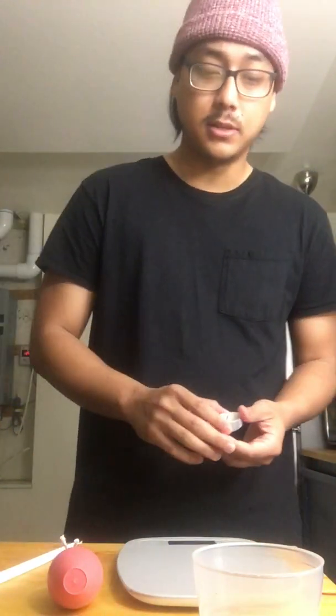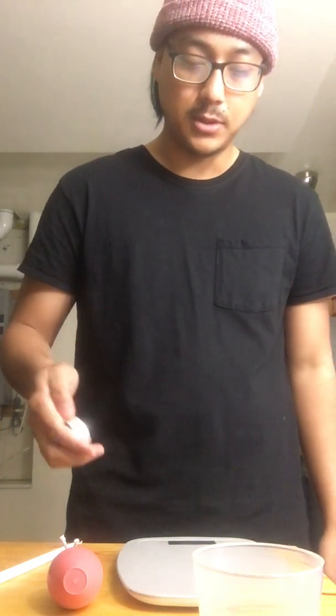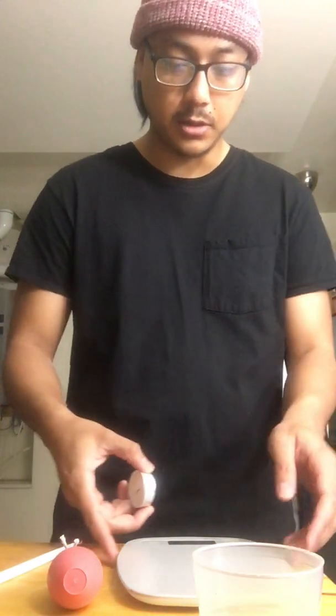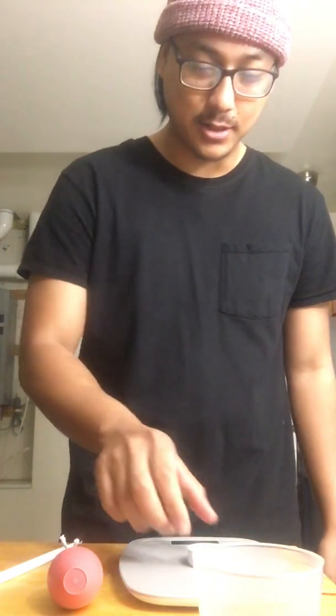And a scale, preferably one that weighs in grams. What you're gonna do first is calibrate the scale. Make sure that the 10 grams is actually 10 grams, about three times. Turn it on, hit tare or zero to zero the scale so that it's even. Place your supposed 10-gram weight — would you look at that, it's 10 grams. Alright, tare it.